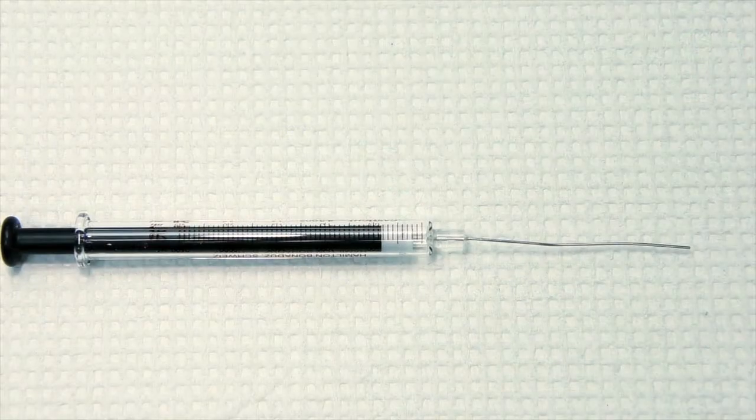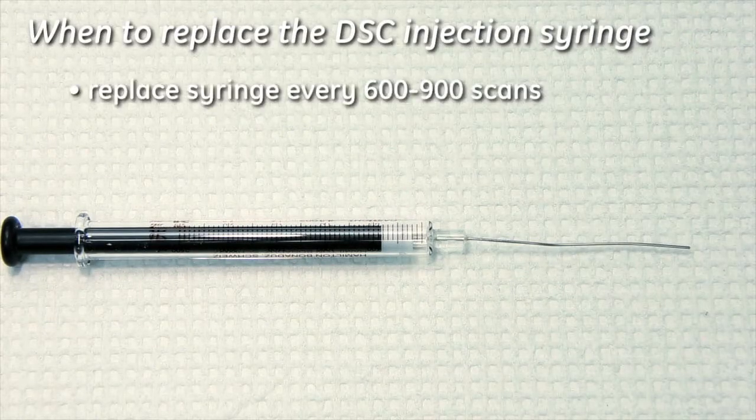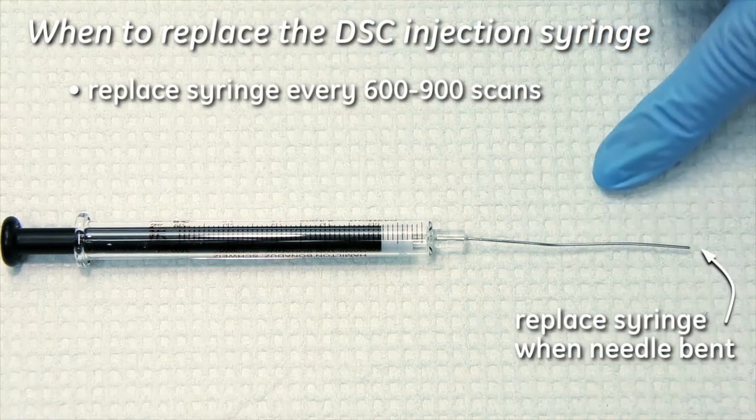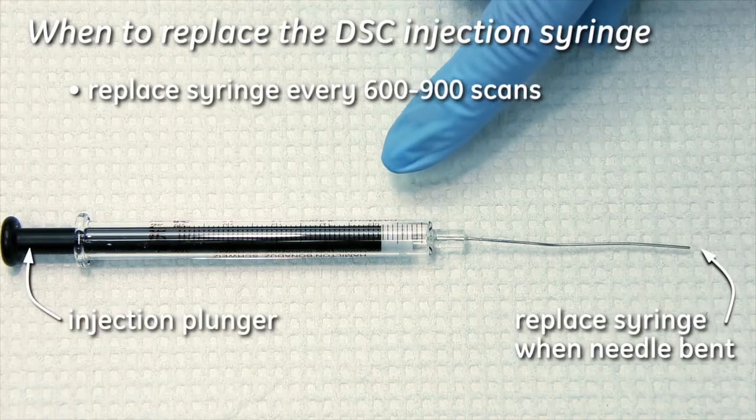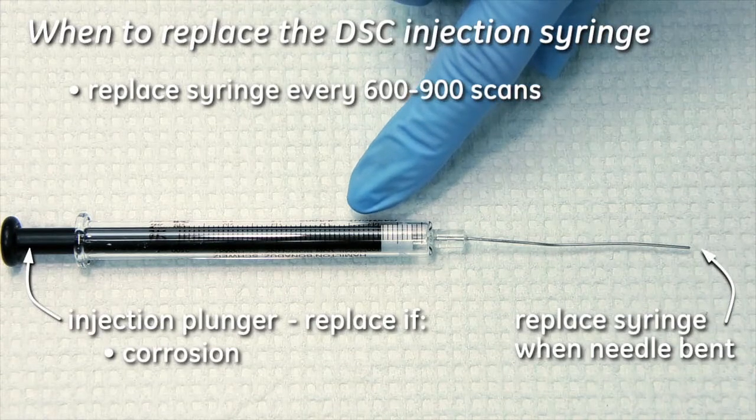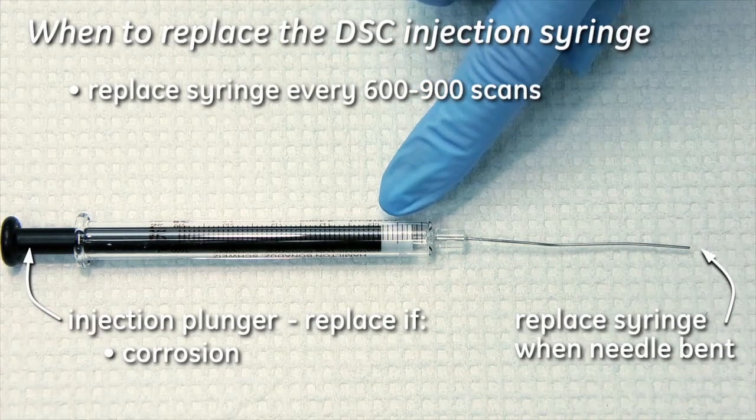You want to replace the DSC injection syringe every 600 to 900 scans when the needle is bent. You also want to replace the injection plunger if you see obvious corrosion around the lower black area or the lower white area of the piston.